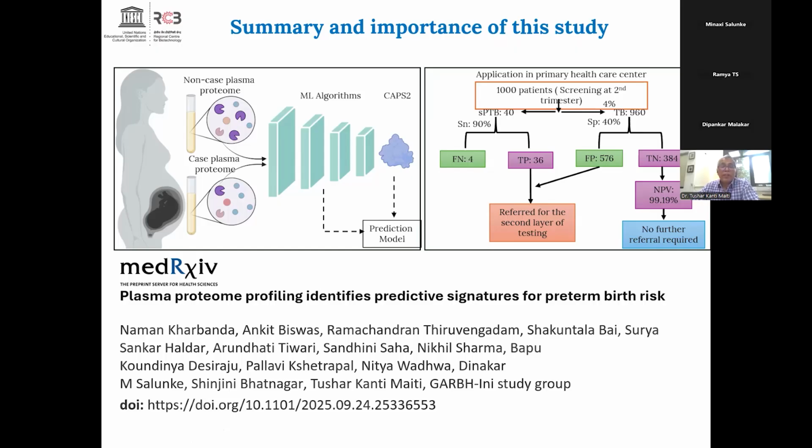So presently we are collaborating with the Max Planck Institute, with the Matthias Mann lab, as well as other consortia where a large number of discovery studies are coupled with our study. We have selected approximately 50 biomarkers which will be further quantified using isotope-labeled proteins and used for India-centric validations in different cohorts in our country. So I will stop here.